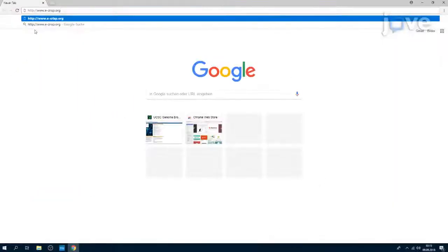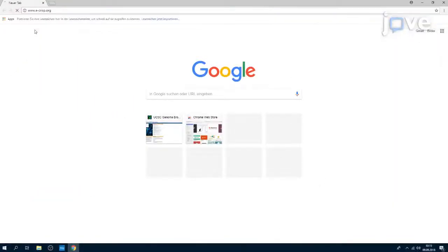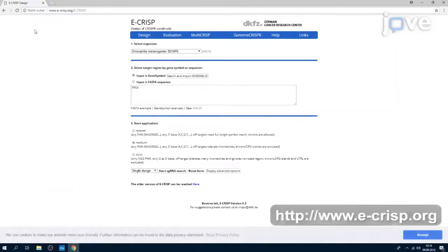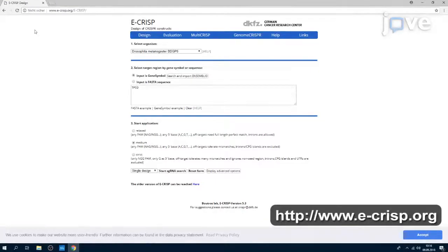To choose guide RNAs of 20 nucleotides for targeting of the chosen genomic locus, use eCRISP Web Tool.